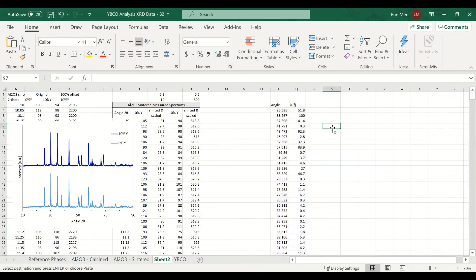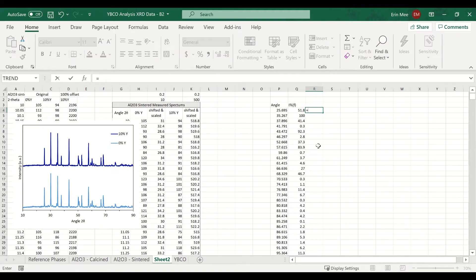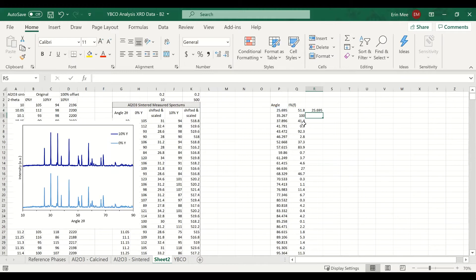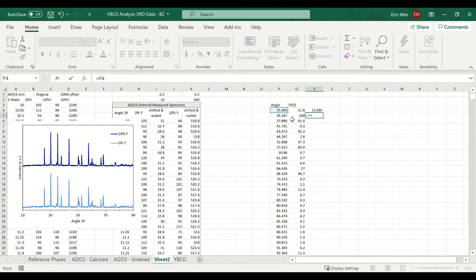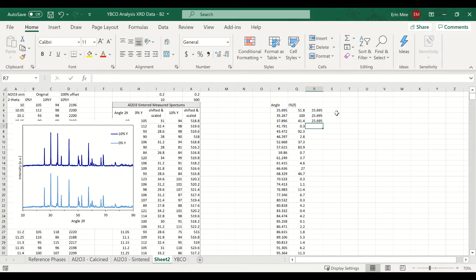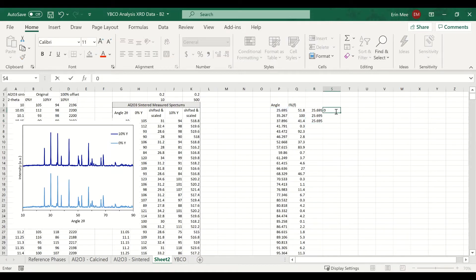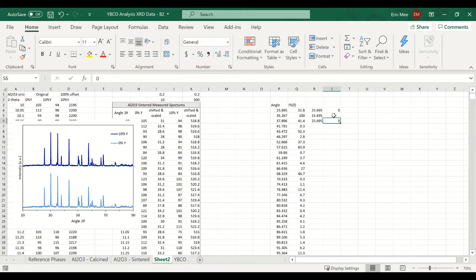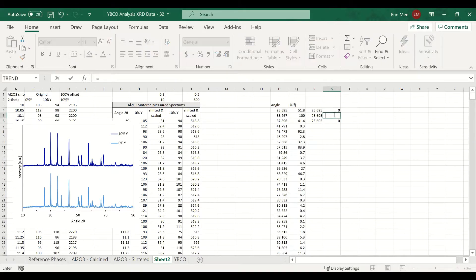To get the display we want, we need to have the angle values repeated three times. And for the intensity: zero for the first value, the actual intensity in the middle, and zero for the third value.